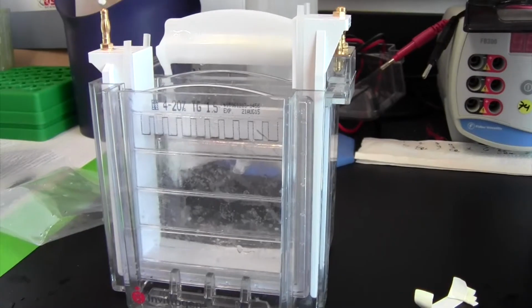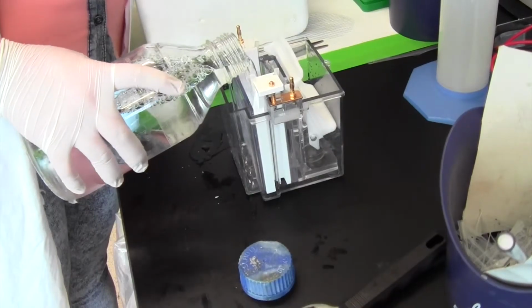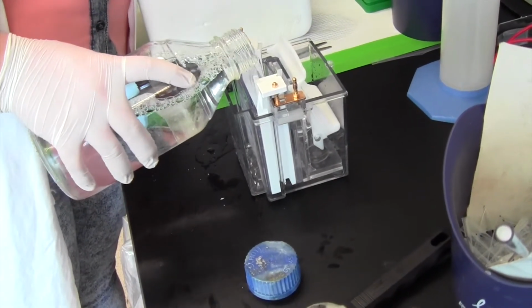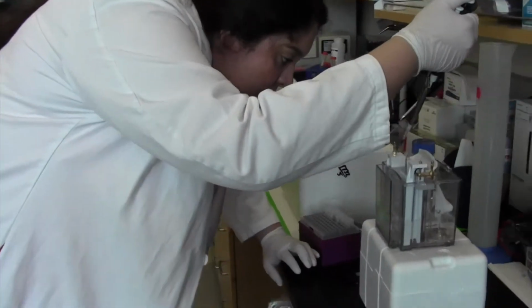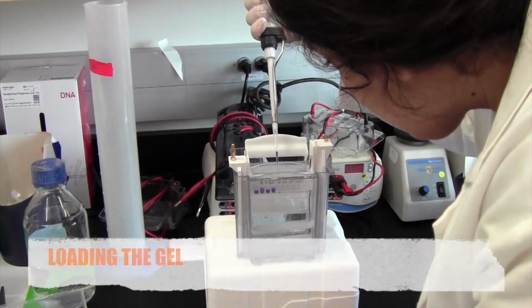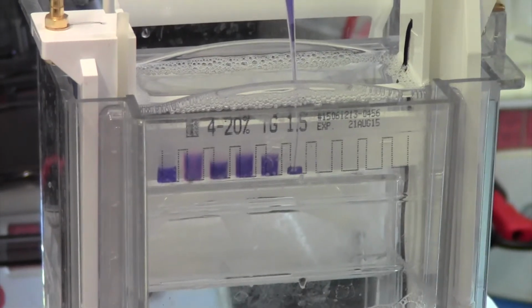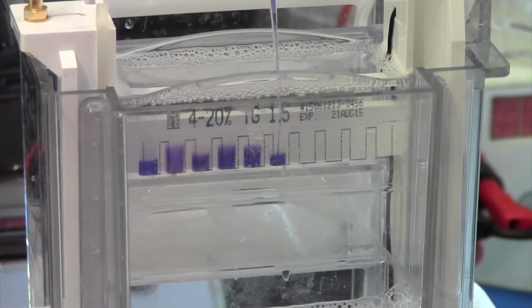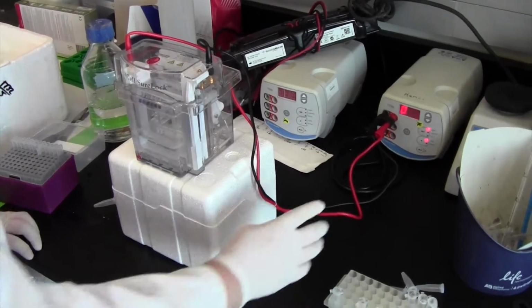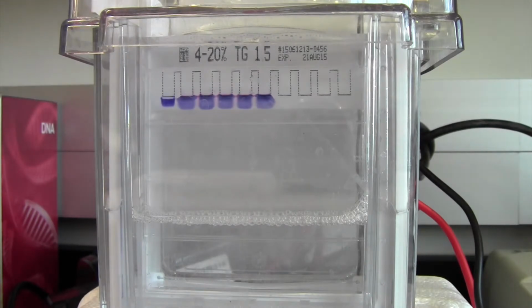A pre-made glycine gel is inserted into the tank with running buffer. The gel is loaded with a protein ladder and samples are loaded into the wells. An electrical current is connected to the tank and set to run for 1 hour.